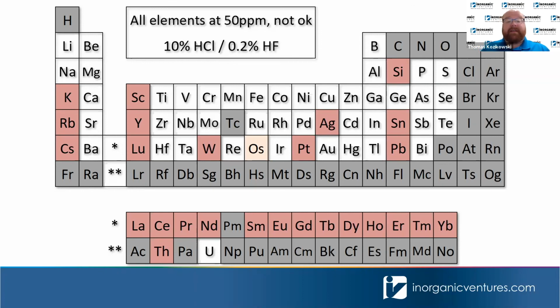There are a lot of different things going on here, and I've detailed that on the next slide, but just looking at this one, you wouldn't think potassium would have any issues, but believe it or not, at high levels with silicon, it can form a gel in your solution and actually stick to the walls of your container. Cesium and rubidium, you also wouldn't expect to see issues, but when you have HCl and platinum involved, you actually create an insoluble cesium hexachloroplatinate.